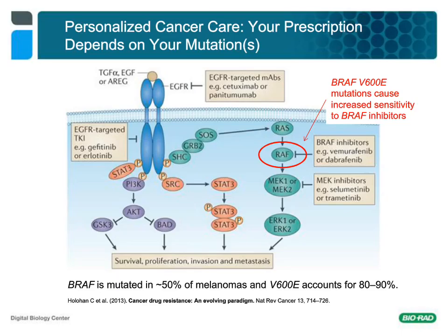The use of tumor genotype to guide patient treatment is routine in a variety of cancers, including melanoma, colorectal, and breast cancer. Roughly 50% of the melanomas have activating mutations in BRAF, and V600E in particular accounts for an estimated 80 to 90% of that half. Personalized cancer treatment in melanoma requires detection of activating BRAF mutations.